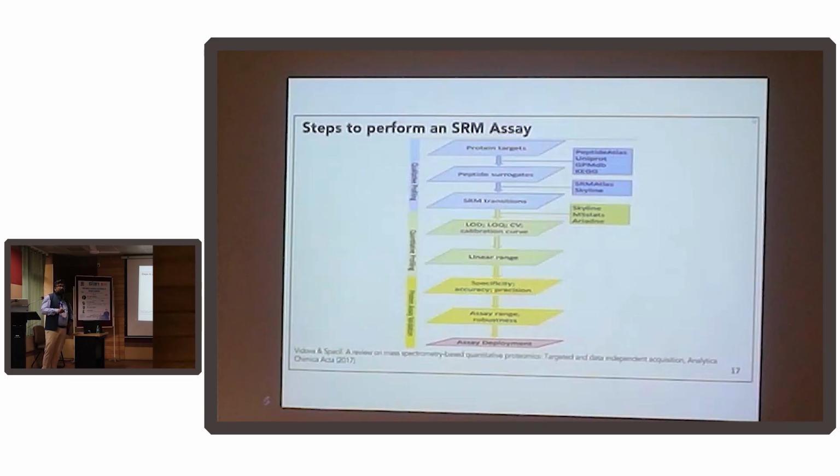How much of the sample you need, how strong your assay is, like is it working on all sample types, is it working on only specific sample types, right? So suppose you're talking of detecting viral peptides. Now when the pandemic came, we came to know that even lions and tigers and monkeys are getting infected, even minks, all mammals kind of became reservoirs for the virus.